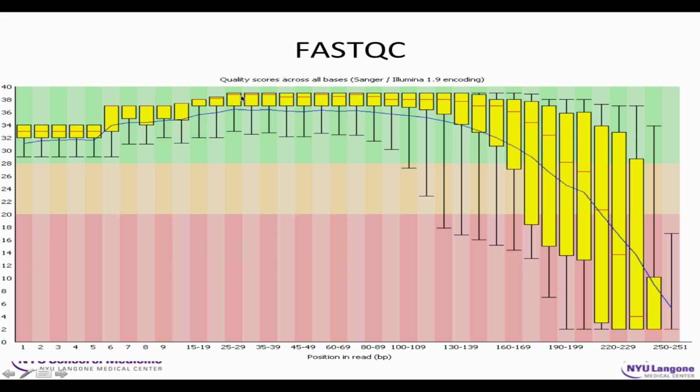So this is a pretty good quality read that tapers off at the end, and it could be saved by some judicious trimming. You could either trim them all to 150 so they're all the same length, or there's software tools that trim from one end until the quality of a window, maybe 10 or 20 bases, reaches some average level.